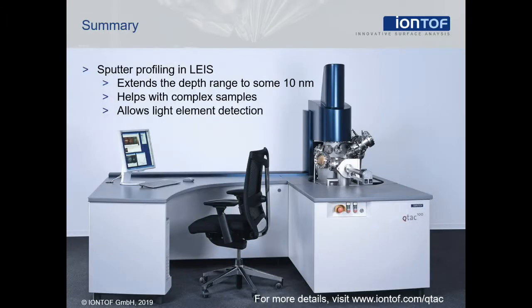To summarize, sputter profiling in LEIS is an additional option to the in-depth information already contained within the spectra. It extends the depth range from a few nanometers to some tens of nanometers. It helps in the analysis of complex samples and multilayers and can allow one to measure the depth profiles of light elements, which are not accessible to the static in-depth information.